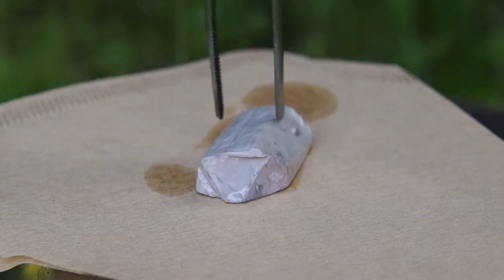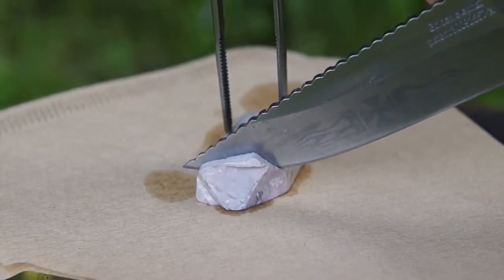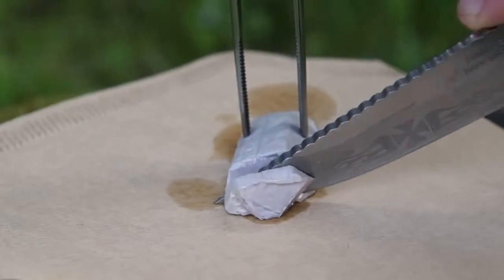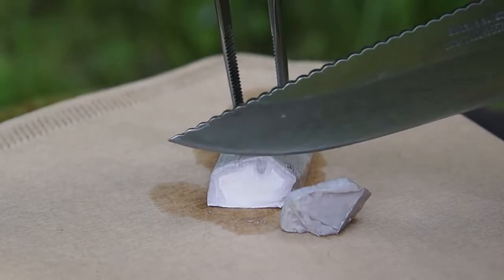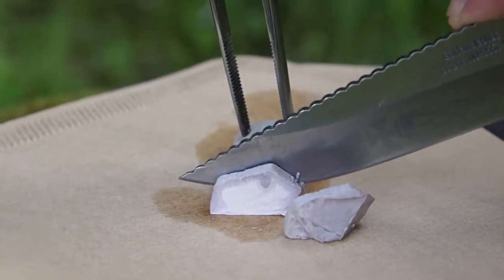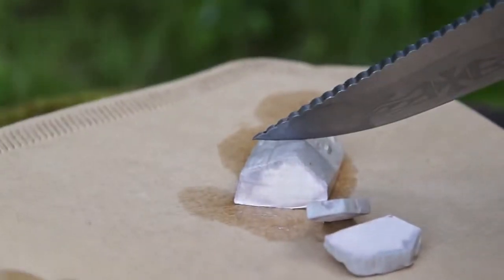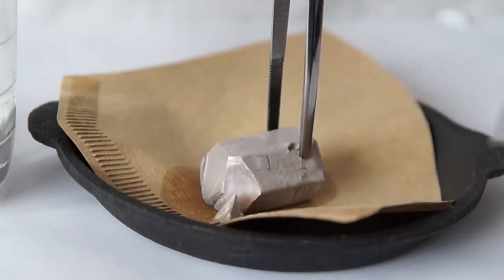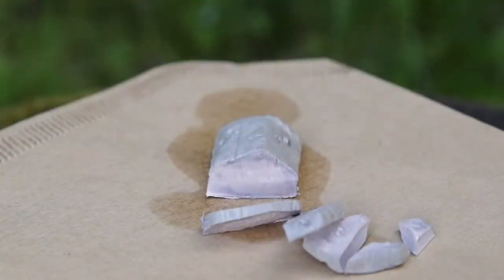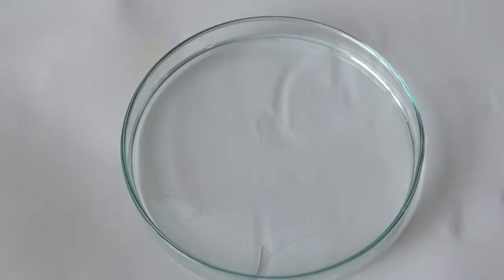First I'll tell you about the physical properties of sodium metal. Density of sodium is almost the same as water, melting point being 97 degrees Celsius. Sodium is a quite soft metal and can be easily cut with a knife. Hardness of sodium is almost identical to an eraser that you use in schools — it requires the same effort to cut it. On the cut edge you can see the shiny surface of sodium, however being in the air it oxidizes very quickly.